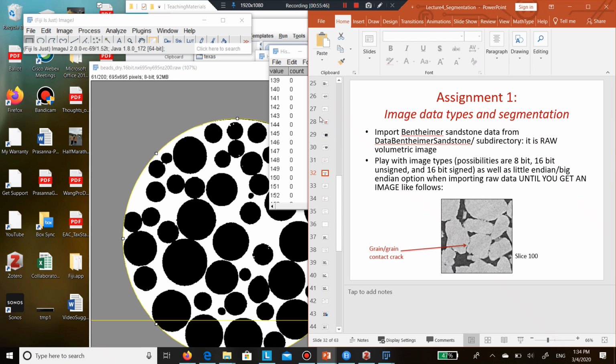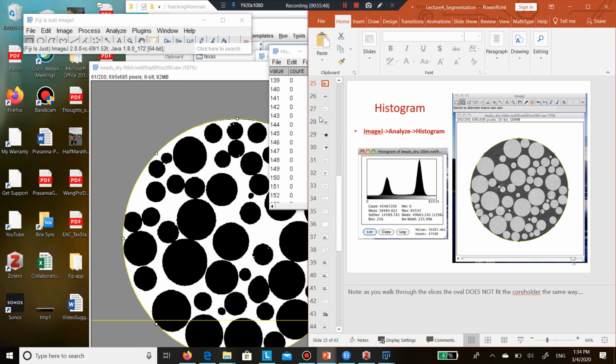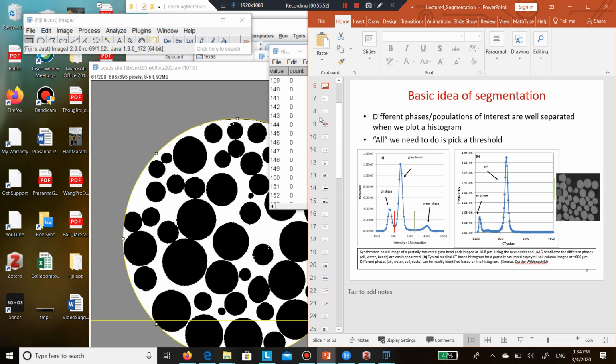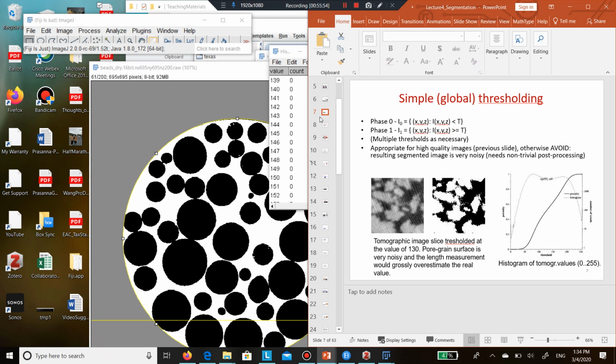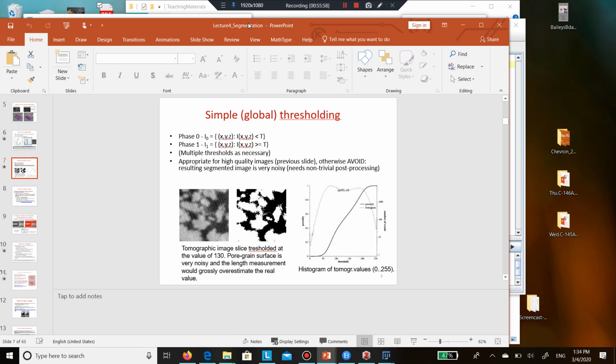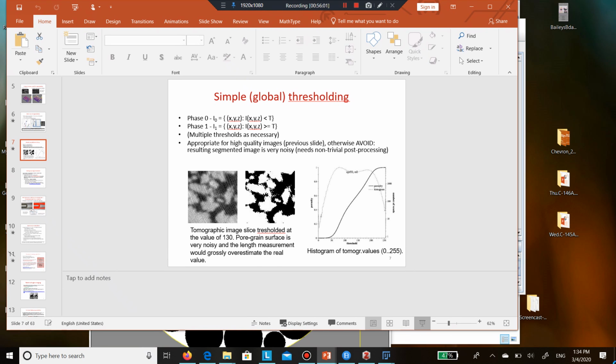All right, so now I will go back to a little bit of a wrap up. Now you've got the idea what global thresholding does.